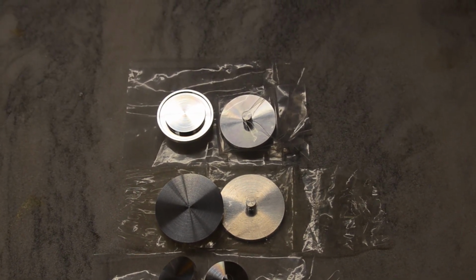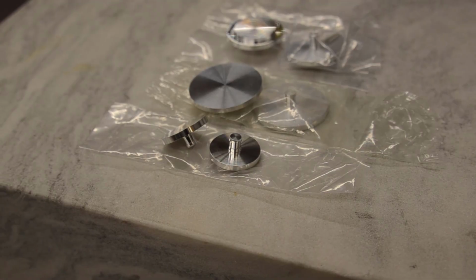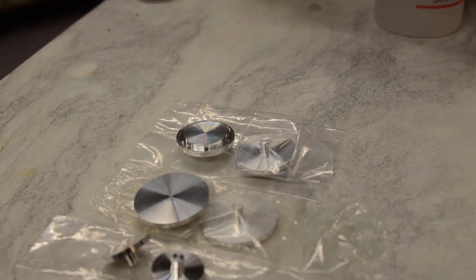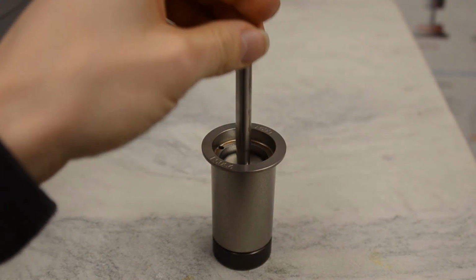The choice of measurement system is driven by a few factors. For volatile liquids, a geometry that minimizes surface area exposed to the atmosphere can reduce the effects of evaporation on the test sample. Viscosity readings can be affected by evaporation of the liquid during the test. Parallel plates with a large diameter can reduce the ratio of exposed area to sample volume. A cup and bob can reduce the amount of exposed area further.